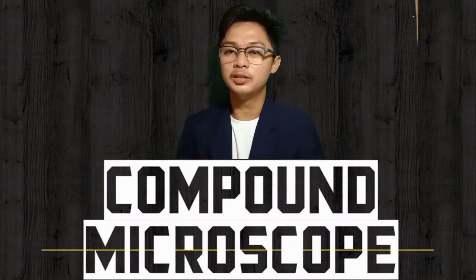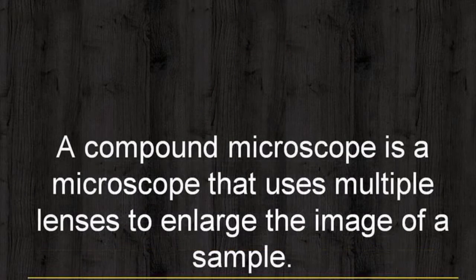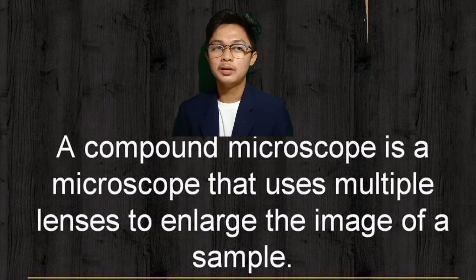Let us now move on to our discussion of the compound microscope. Anyone here has an idea of a compound microscope? Well, a compound microscope is a microscope that uses multiple lenses to enlarge the image of a sample.